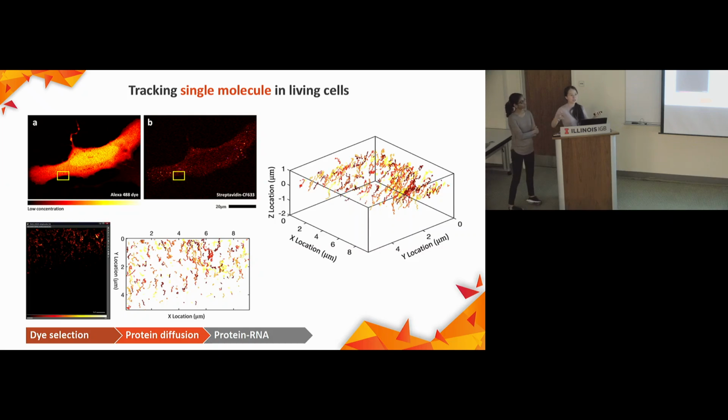So like we already know it's a pre-made sample, and we already know the protein is labeled by single molecule. Okay. So it's not a problem in our case. But if you're labeling the sample by yourself to do a confocal image, then the labeling might be tricky. The concentration you're using, how much you're incubating, is gonna vary. Okay, cool, thank you.